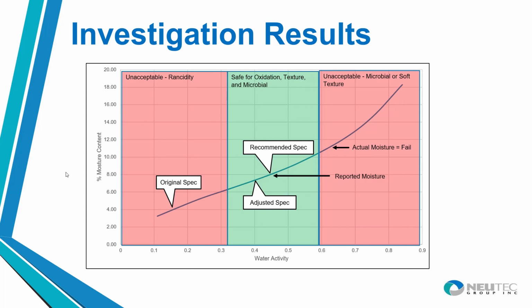So if you move to releasing off of just water activity, then moisture content can be sort of an afterthought. It's a way to optimize production and meet the standard of identity, but it's not driving the stability and setting you up for a situation where you could have failure. Because water activity, which is driving this, never fails. As long as you meet the water activity specification and you use the instrument correctly, then you're going to be okay.